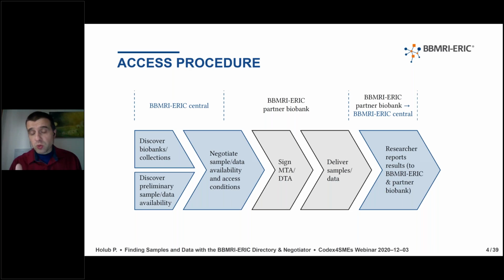This is still what you are doing on the level of the whole Bbmri-Eric, and we're providing tools that are implementing both the discovery phase and the relatively efficient negotiation phase, even if you are negotiating with a large number of biobanks at the same time. But this is already where we're handing over to the partner biobanks, because eventually it is the biobank and collection representatives that are negotiating in that negotiator platform.